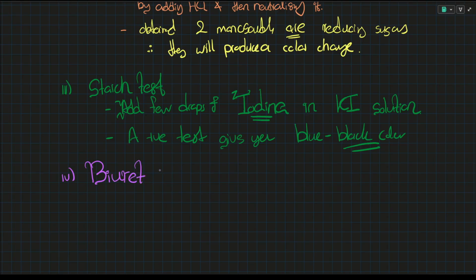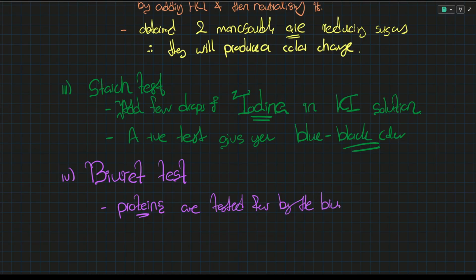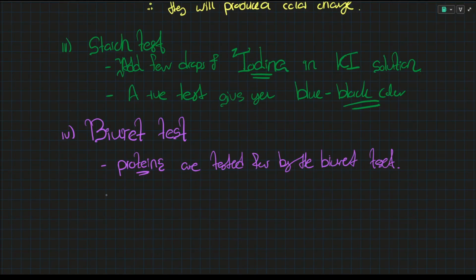Biuret. Okay. Biuret test. We're using the Biuret test for proteins. Proteins are tested for by the Biuret test. How can we test for proteins and why does it work?